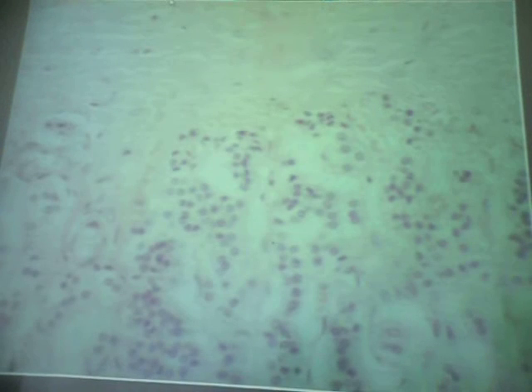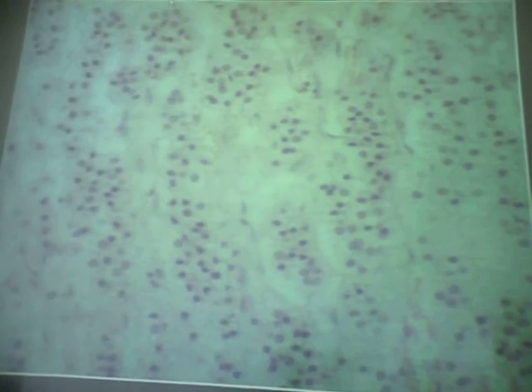Okay? All right, the middle region of the cortex in the adrenal glands, here the cells are arranged in parallel bundles called fascicles. Remember when you studied muscle in AP1, muscle fibers or cells often arranged in bundles called fascicles? This is what you have here, roughly parallel bundles.